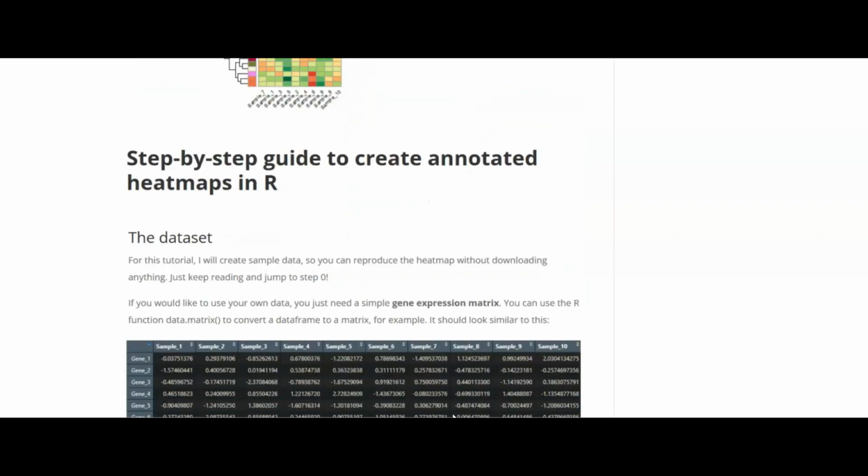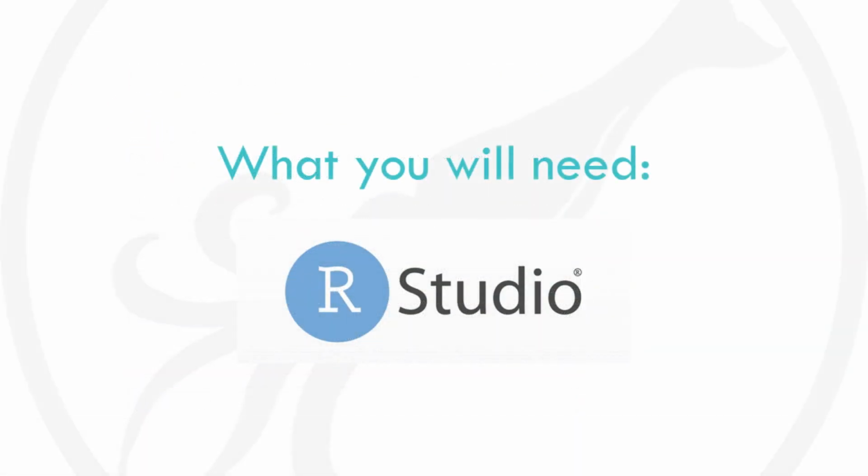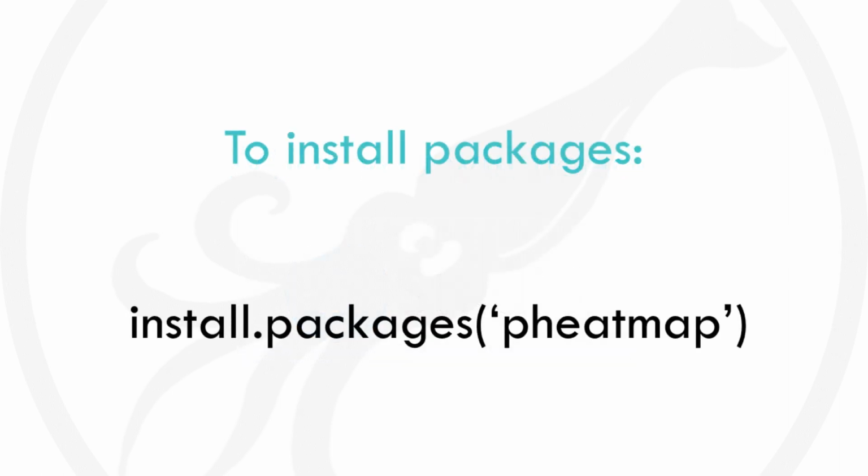For this tutorial you will need R or RStudio, and you will need to install the pheatmap package. So if you're ready, let's dive in.